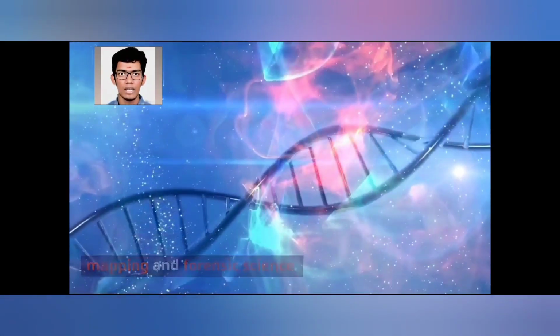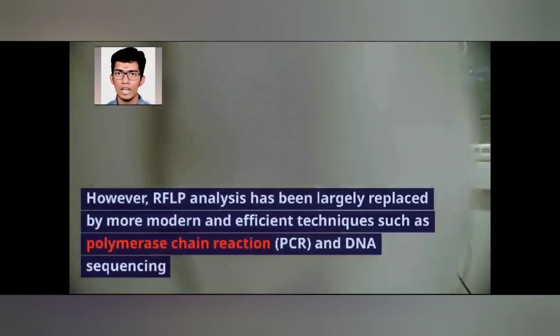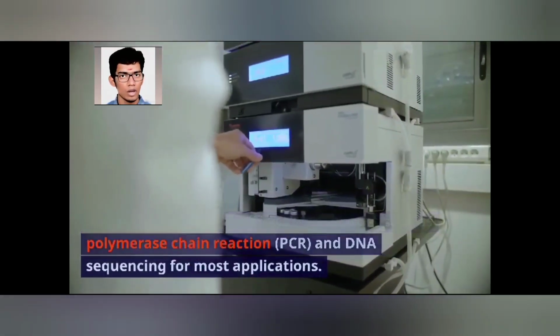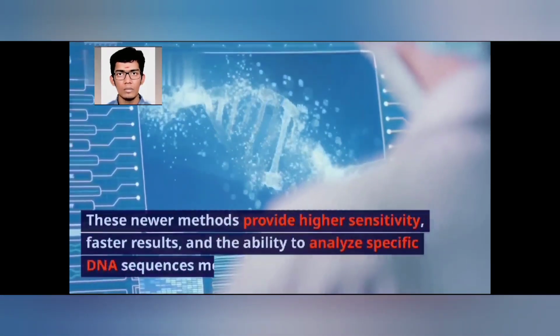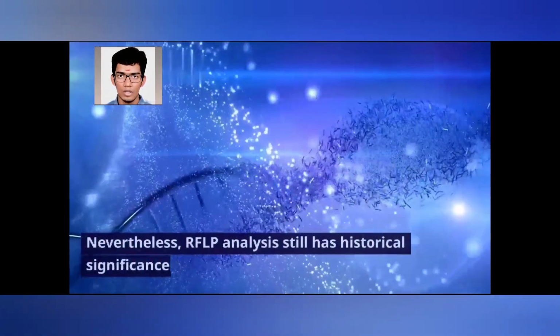However, RFLP analysis has been largely replaced by more modern and efficient techniques such as polymerase chain reaction, PCR, and DNA sequencing for most applications. These newer methods provide higher sensitivity, faster results, and the ability to analyze specific DNA sequences more precisely. Nevertheless, RFLP analysis still has historical significance in the field of molecular genetics.